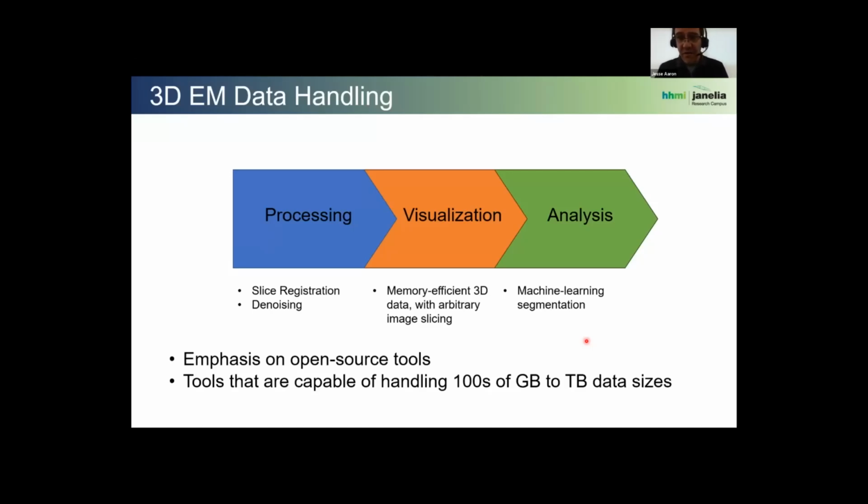And for the most part, all of these tools are capable of dealing with what we lovingly call big data, and that has lots of different definitions. But for us, big data, from a quantitative standpoint, could mean hundreds to thousands of gigabytes. But really, to me, it means data that is too big for you to load into the memory of the computer that you have. And most of these tools have ways to get around that problem.